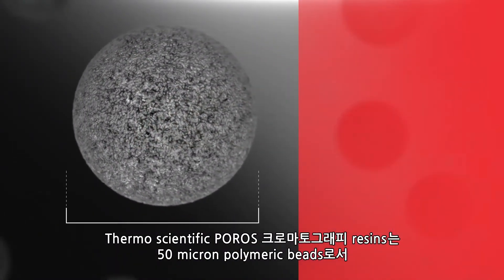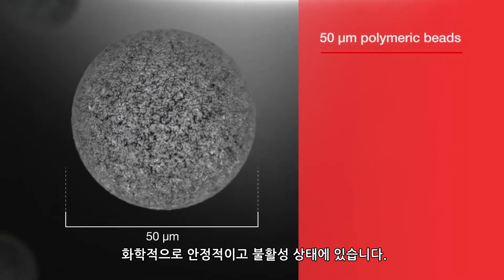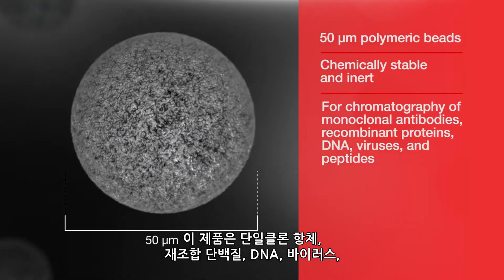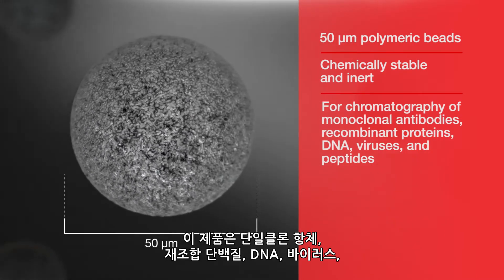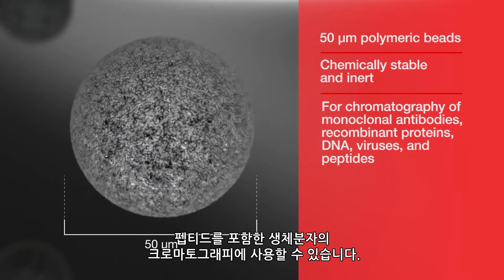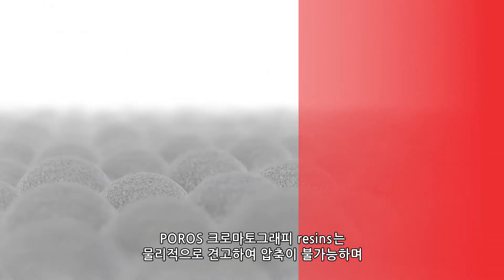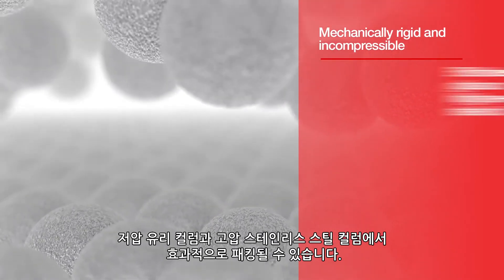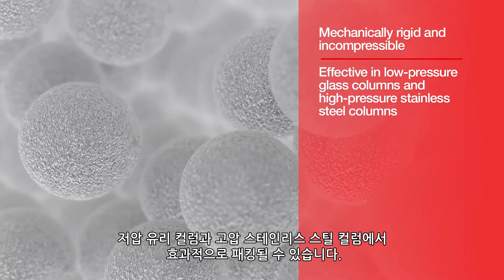Thermo Scientific Poros chromatography resins are 50 micron polymeric beads that are chemically stable and inert. They can be used for the chromatography of biomolecules including monoclonal antibodies, recombinant proteins, DNA, viruses, and peptides. Poros chromatography resins are mechanically rigid and incompressible and can be packed effectively in both low-pressure glass columns and high-pressure stainless steel columns.